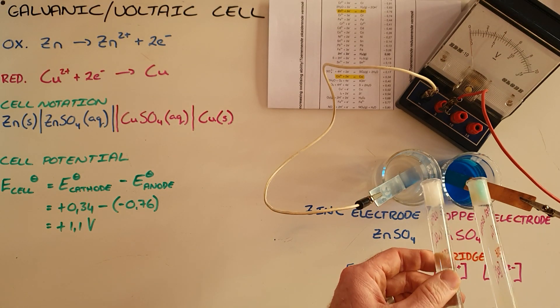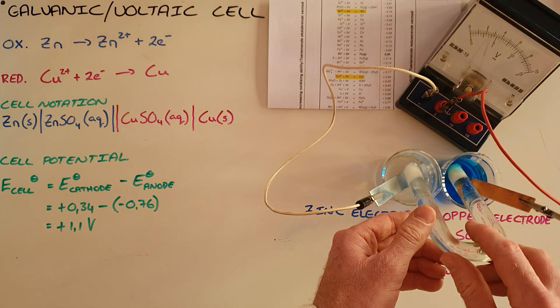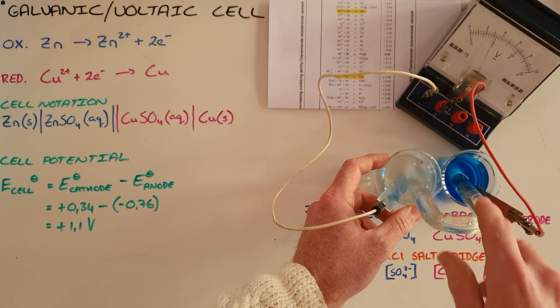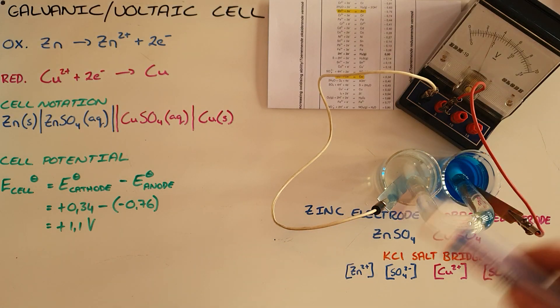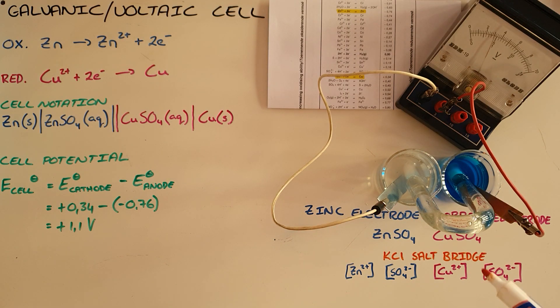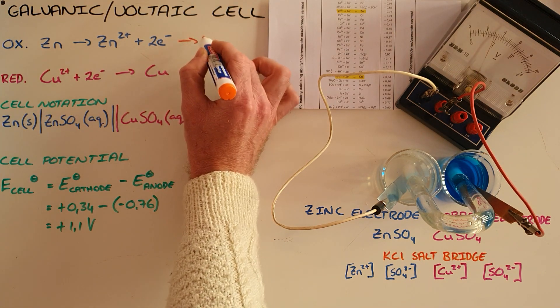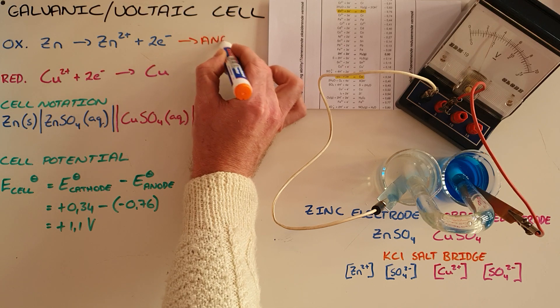And we see that as soon as I complete the circuit, the voltmeter measures a voltage since there is now a complete circuit and the salt bridge now acts to maintain electrical neutrality. So what we find happening in this electrode over here where oxidation takes place, we know that oxidation always occurs at the anode.